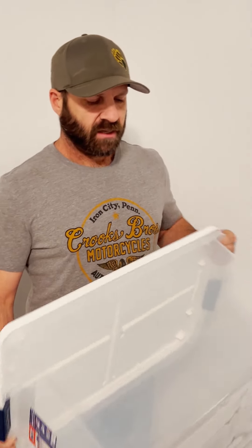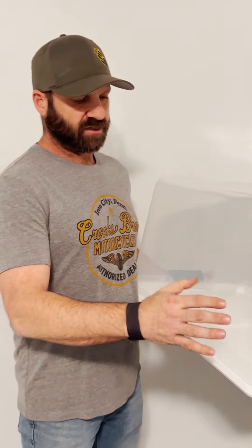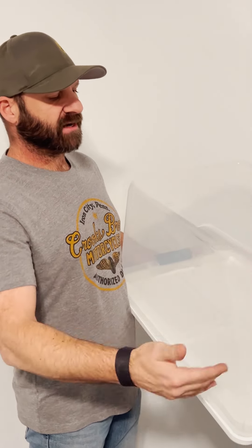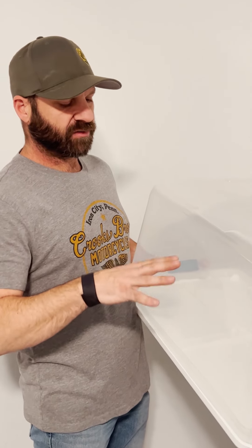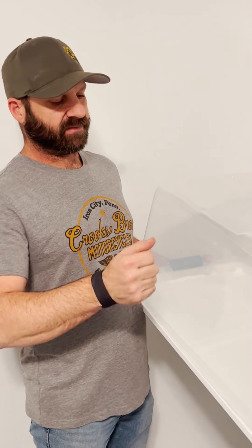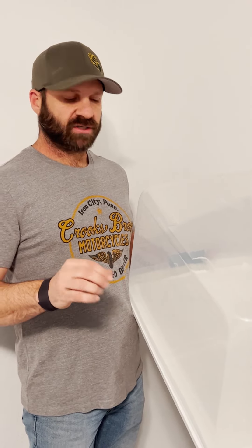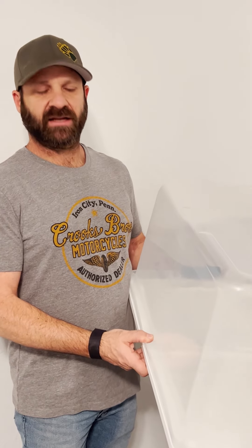Basically what a still air box does is create an environment that keeps the air still, so when we do mycology work we stick our hands in here. This dome keeps the air from flowing back and forth, keeping all the particulates inside so they're not moving around and getting into our work. We'll spray the inside down with a bleach and water solution — that should kill all the particulates, bacteria, any other fungus or spores floating around in there. Then it's a safe environment to put our clean hands into and do mycology work without having to buy a flow hood, which would be the ideal setup.